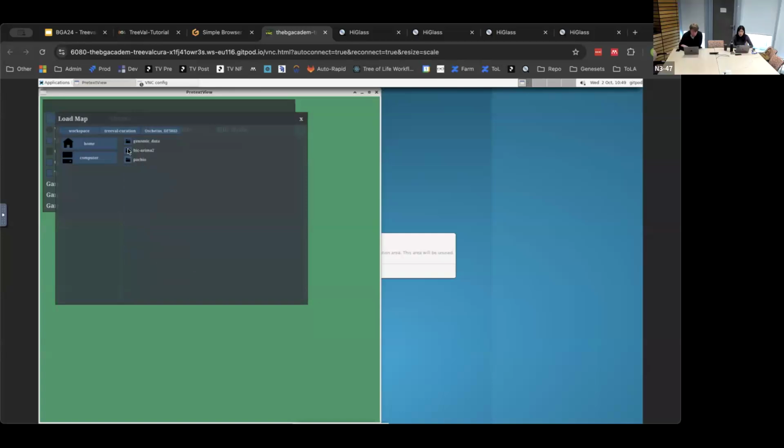Okay, this is what the PretextView looks like. Do you know which the Pretext file is, Damon? If you mount it already, it should be on the Tree of Life server. Are you local? No, it's okay, on the Git folder. Okay, in that case, ask Damon, it should be in the same work folder, right? I found it now. Okay.